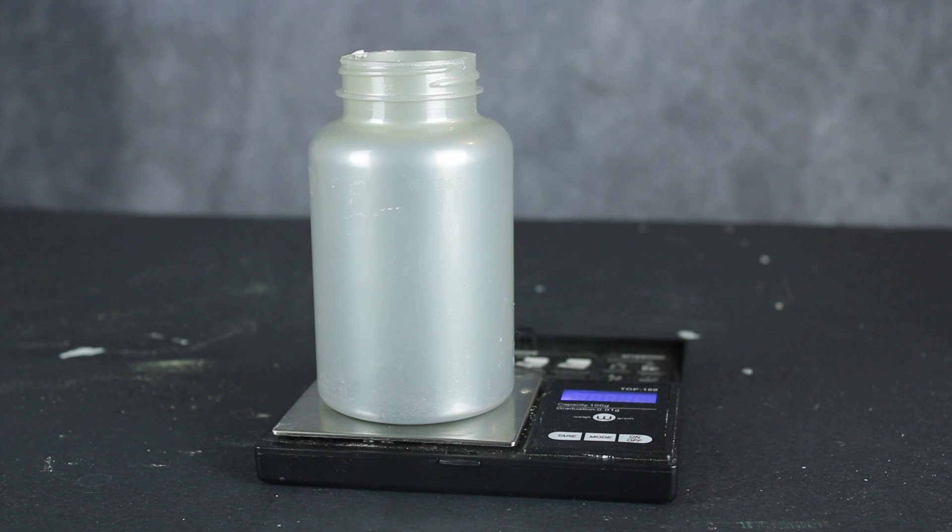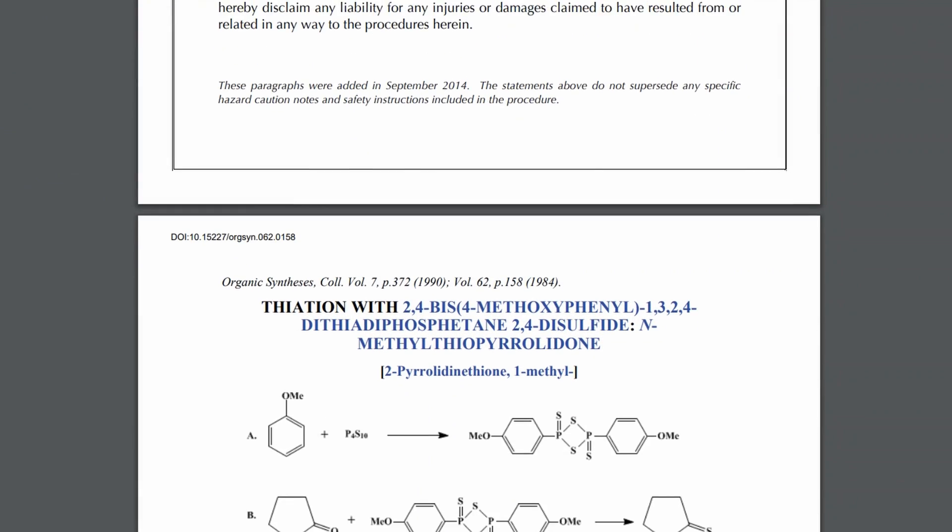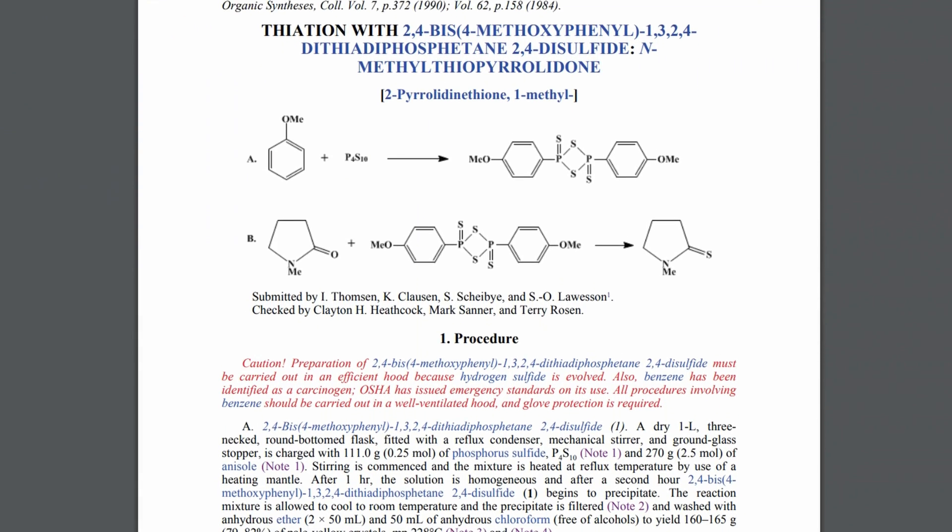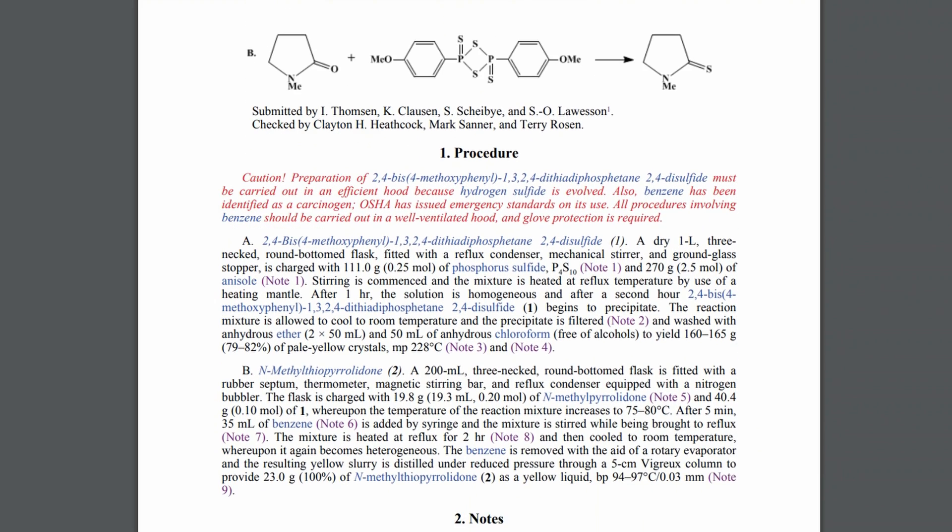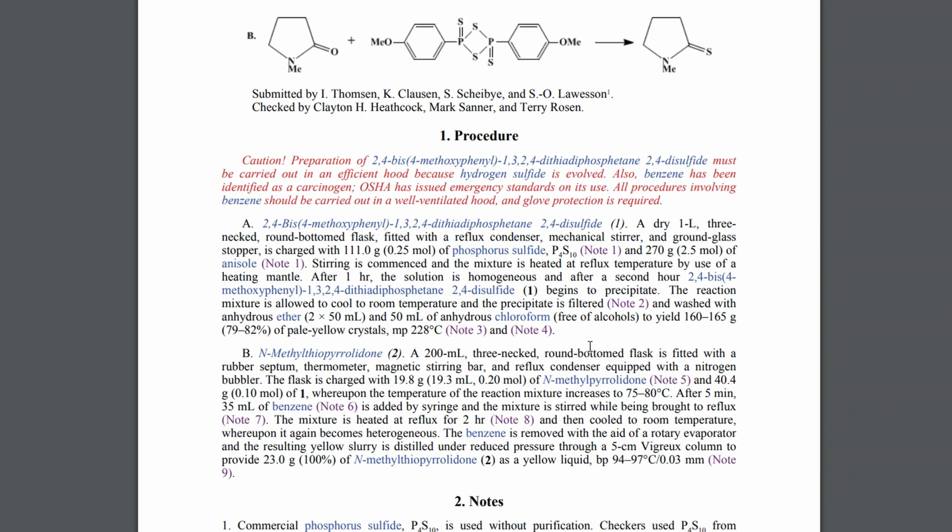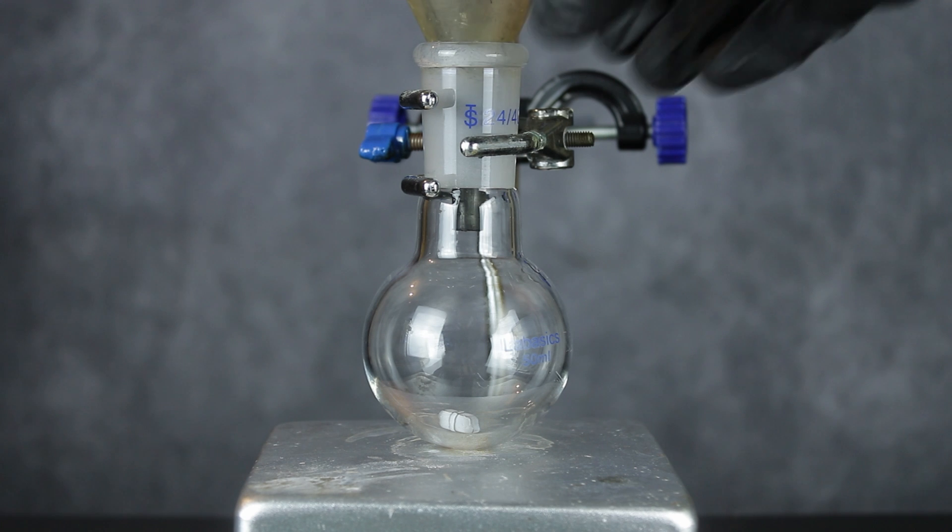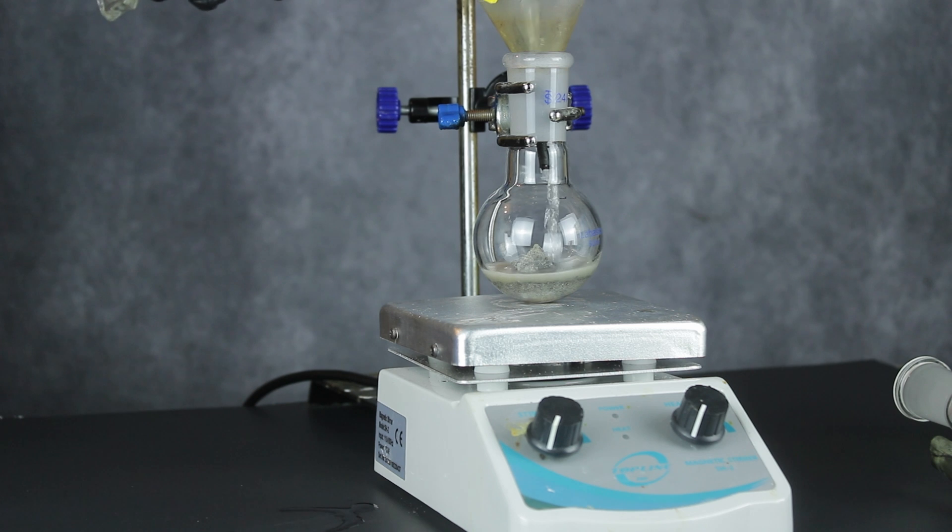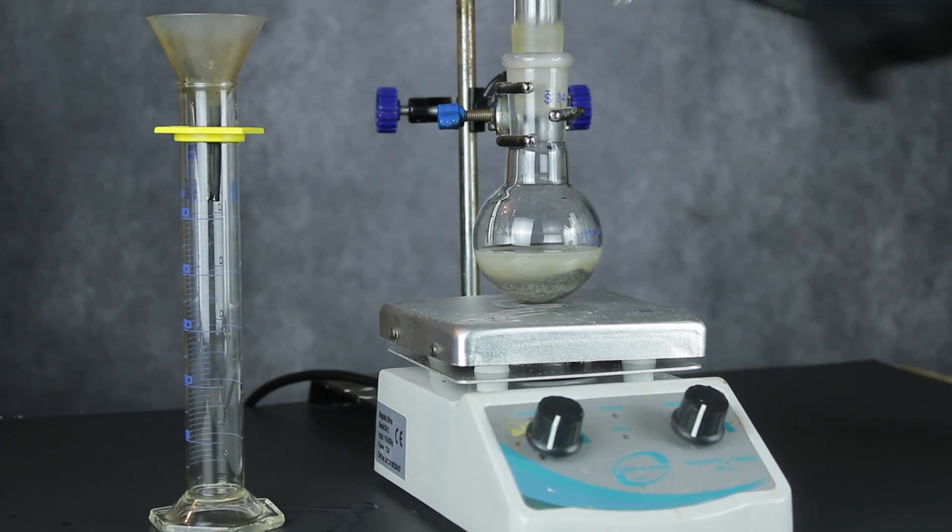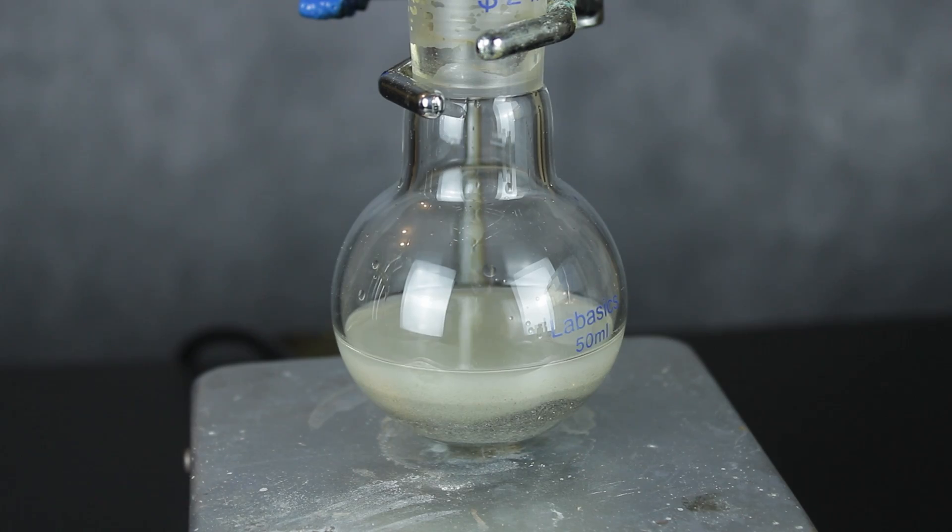So now that I had the pentasulfide, the next step was to add to the anisole and convert it to Lawson's reagent. To do this, I decided to follow the original procedure provided by Dr. Lawson himself, which told me that I needed 25.5 mils of anisole for the amount of pentasulfide I had. To my 50 milliliter round bottom flask, I added the 10.45 grams of phosphorus pentasulfide, followed by the required amount of anisole. Then a reflux condenser was connected, stirring was commenced, and I moved everything outside for ventilation.